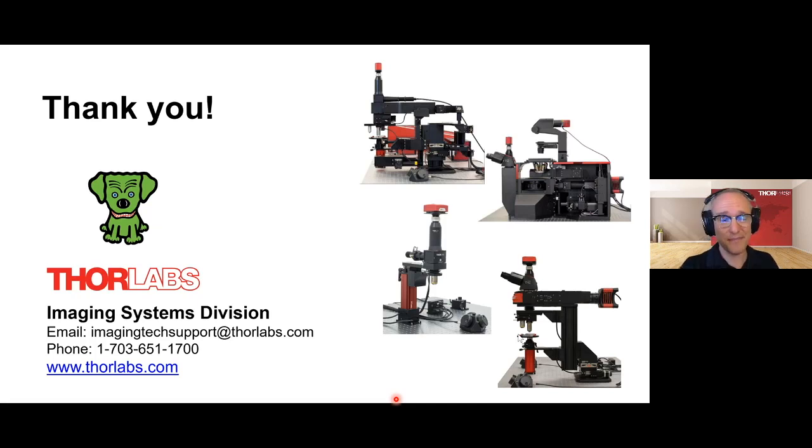It's very fast, but you're not imaging each individual area of the sample in a set way. In the raster scanning techniques I described so far, all the pixels are imaged in the same sequence from frame to frame. If you use two resonant scanners, because it spaghettis around, that is not the case. So it's possible, and some people have done it for high-speed imaging, but I would not say it's frequently used in laser scanning.